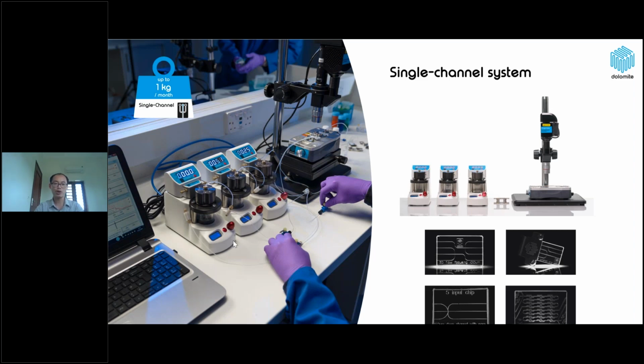The pressure pumps connect to the microfluidic chip using tubing, valves and connectors. The chip is located under a microscope to visualize all the processes occurring inside it.